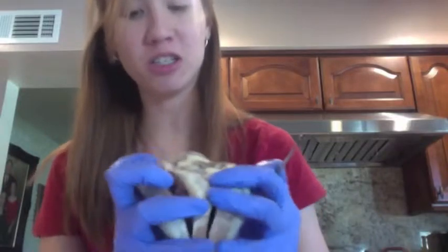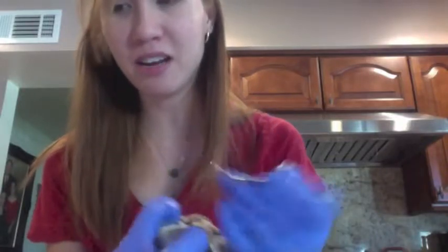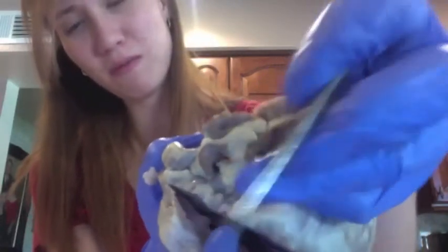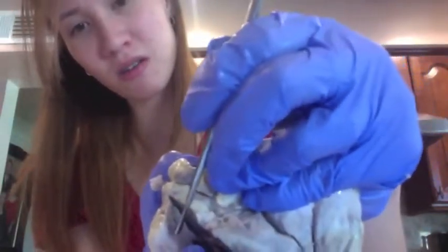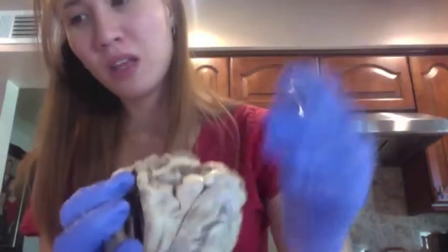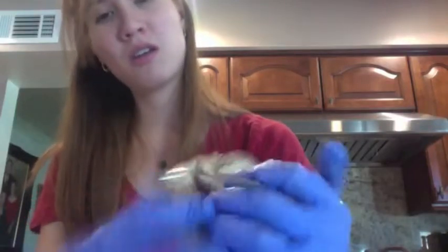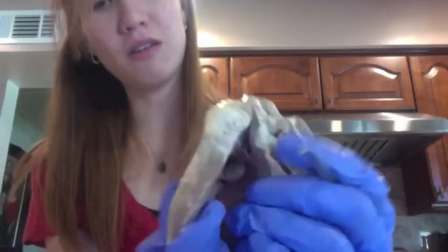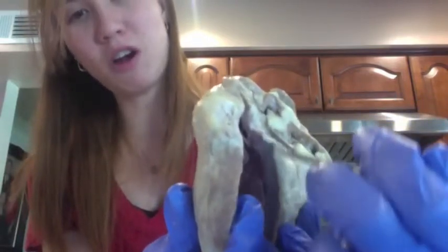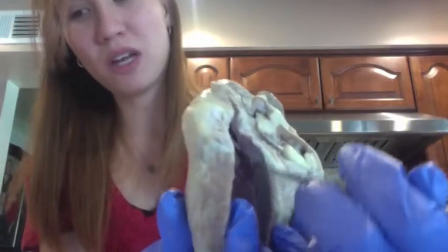So moving on to the internal anatomy of the heart, we have the pectinate muscles of the inner wall of the right atrium, which would be right about in here, if you can see that there. Then we have the myocardium, which is all of this meat right in here.